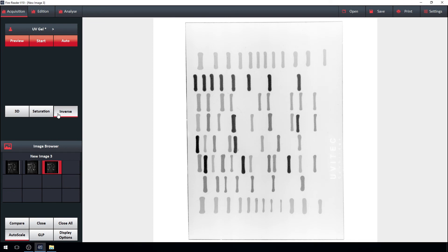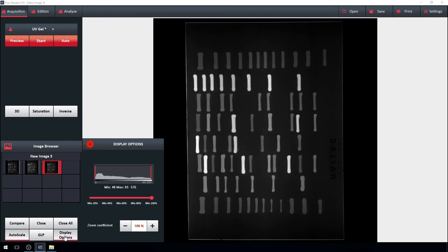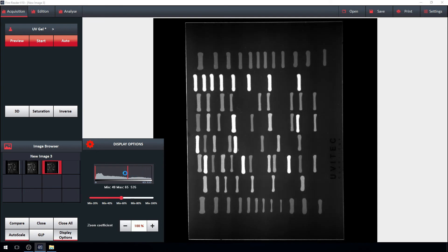You may also play with the image dynamics. But don't worry, the software will always keep the raw data, no matter the display settings.